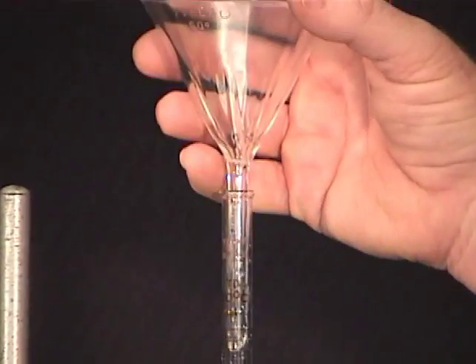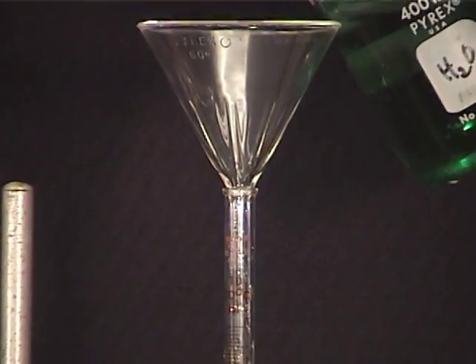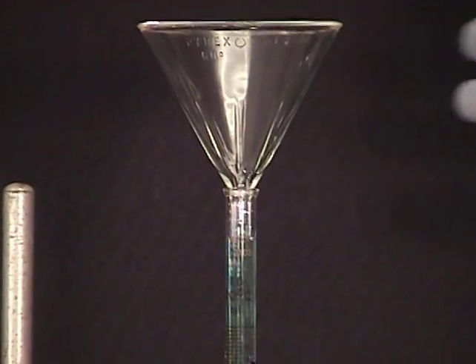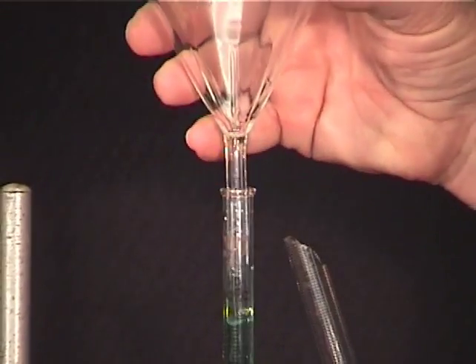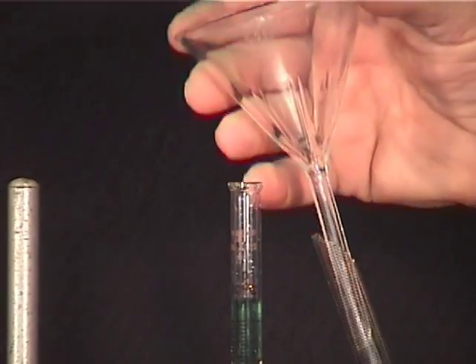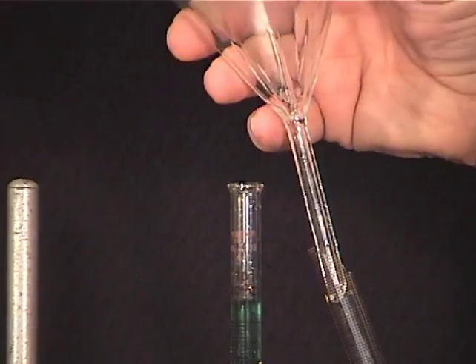To do this, use a funnel to add 5 milliliters of the reagent to the burette. In removing the funnel, be sure to clear the neck of the burette before twisting the funnel downward. If you don't, the stem of the funnel may break the glass at the top of the tube.